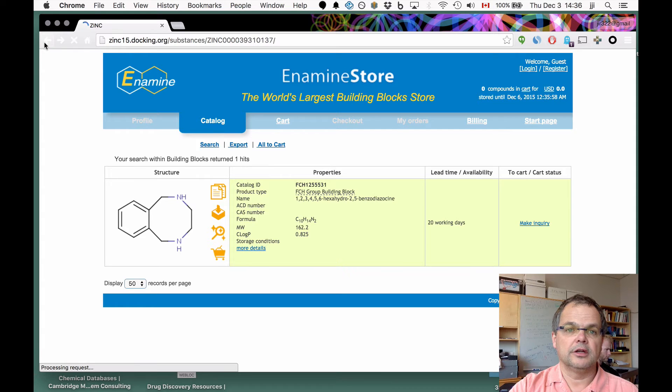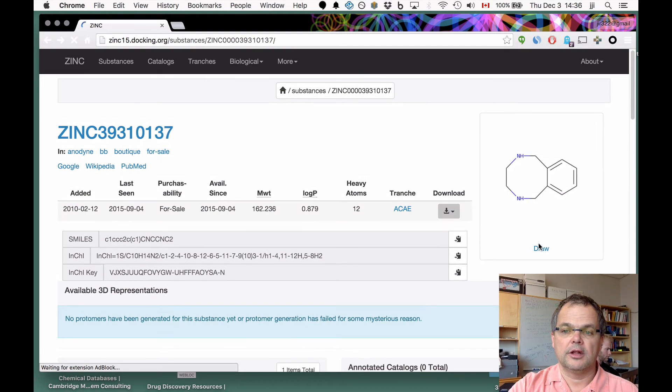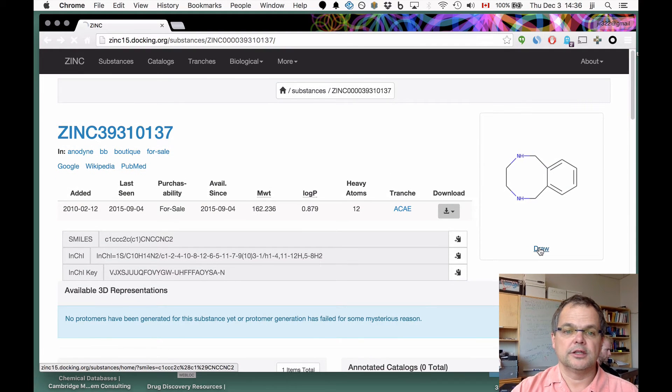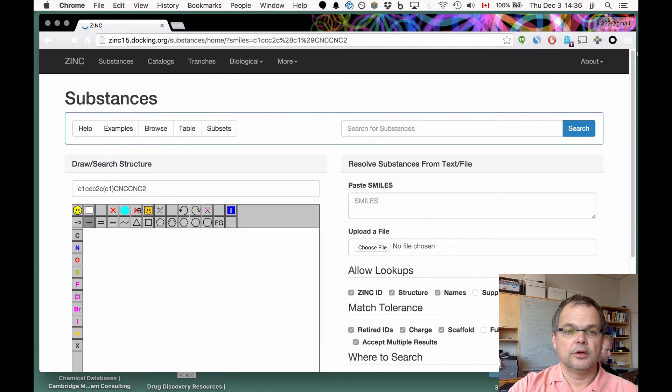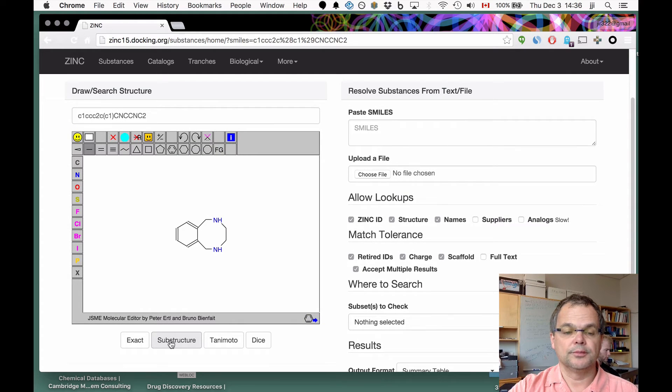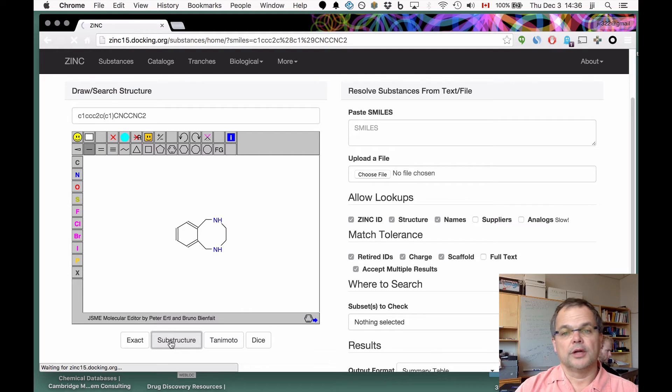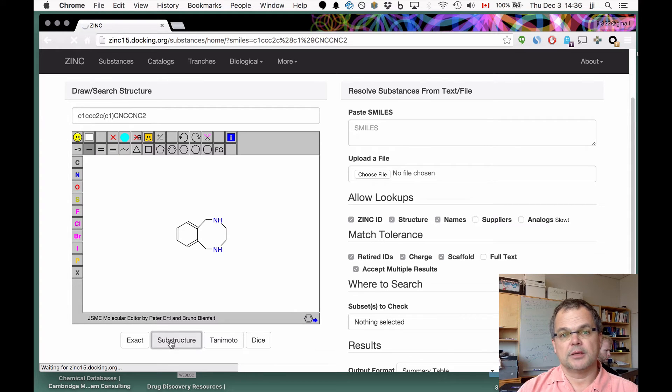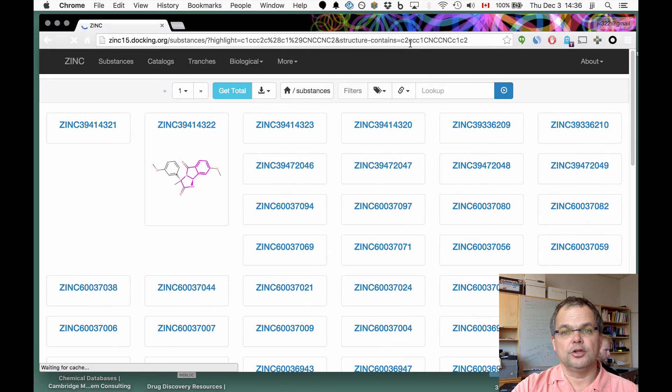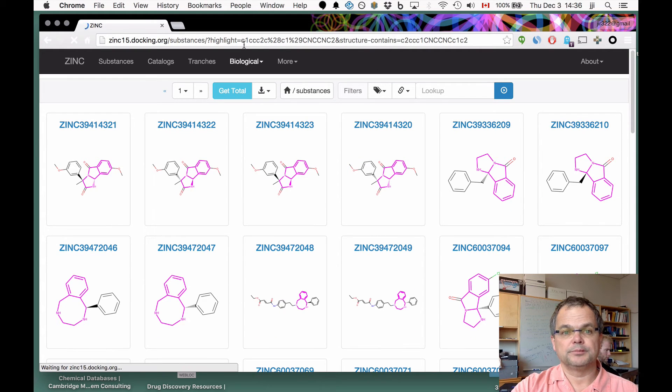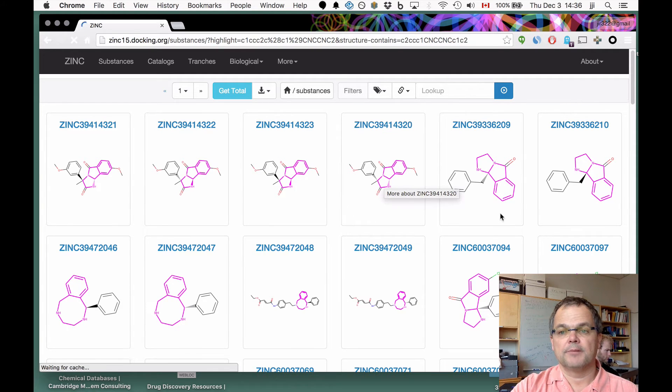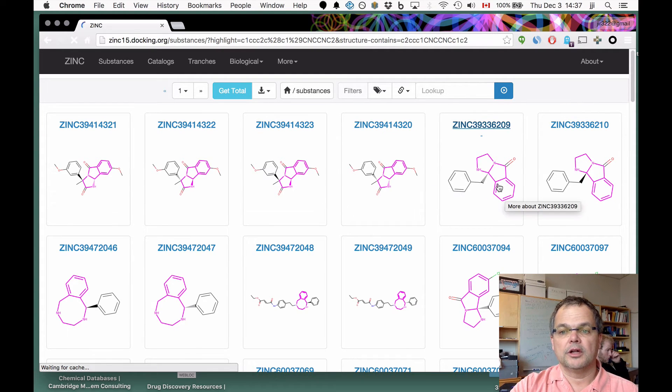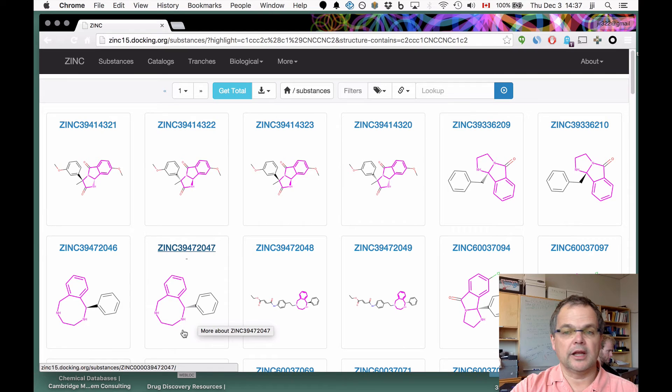We're going back to Zinc, so that's an illustration of similarity. Now I've clicked on the draw button to bring us back to the drawing tool. Now we're going to use the substructure tool. When we search here, we're going to ask for show us all the molecules that have this moiety, this chemical structure as a substructure. As you can see in the URL, it's been URL encoded.